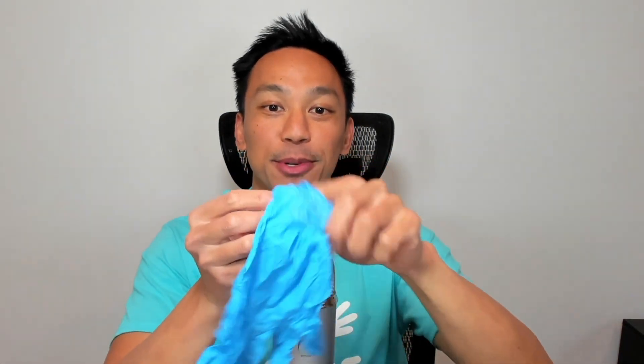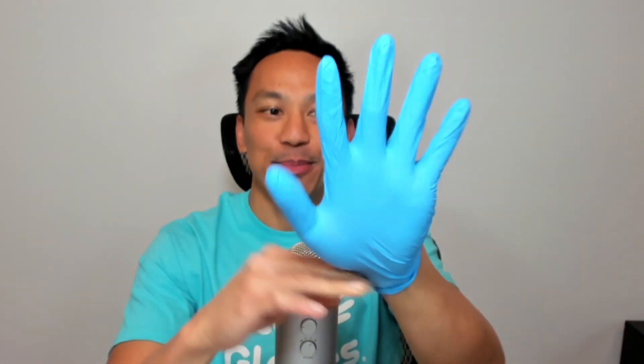We're going to do an EcoGloves stretch test just to show you how strong and durable these biodegradable nitrile gloves are. So let's go ahead and put the glove on. You can see how form-fitting it is. And let's go ahead and give it a stretch. Take a look at that.